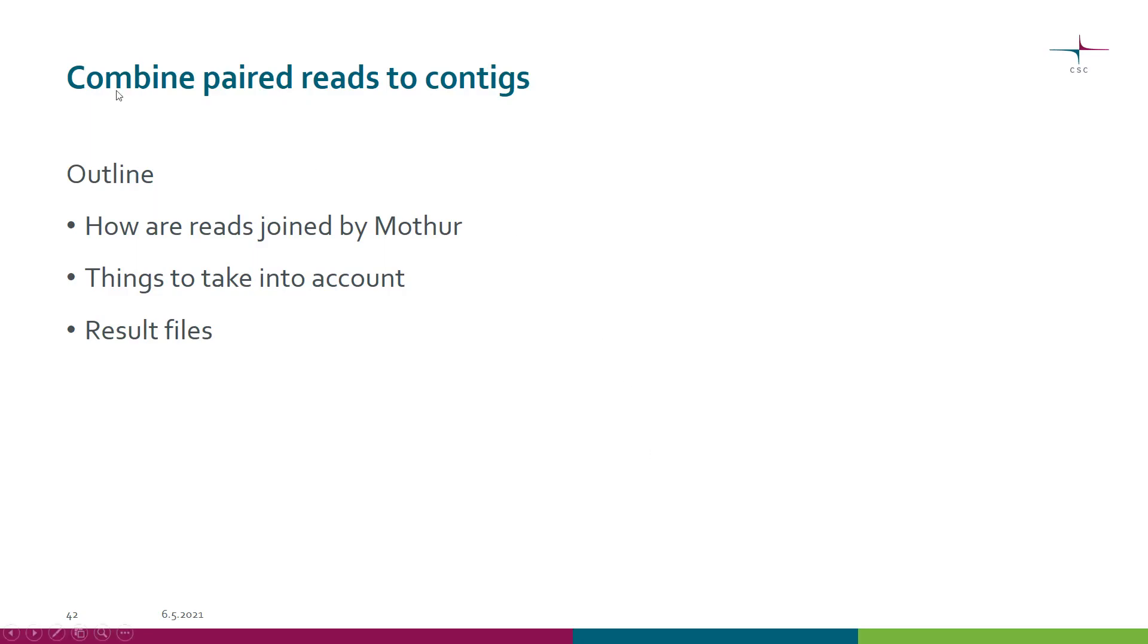In this tutorial we look at how to combine paired reads to contigs. If you have Illumina sequencing data, it's typically paired end and we need to merge those pairs into contig sequences.